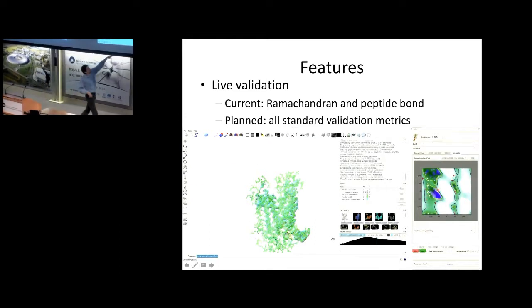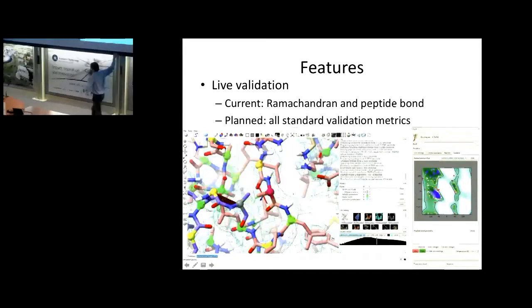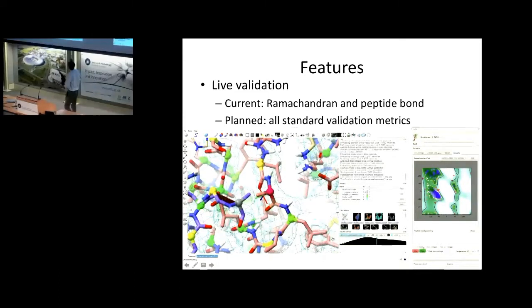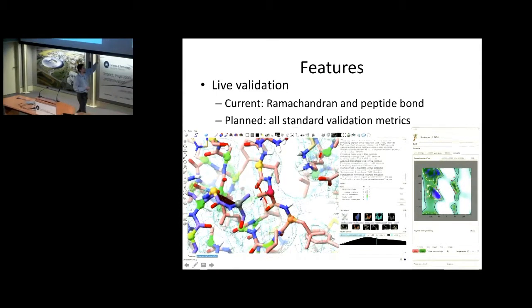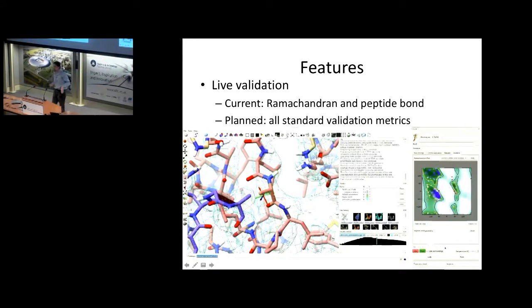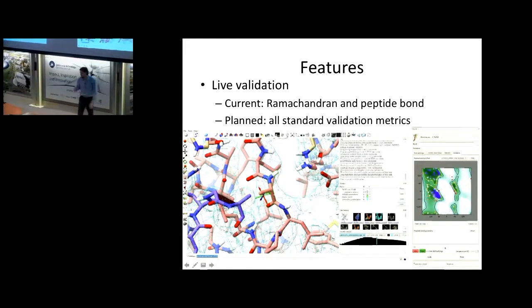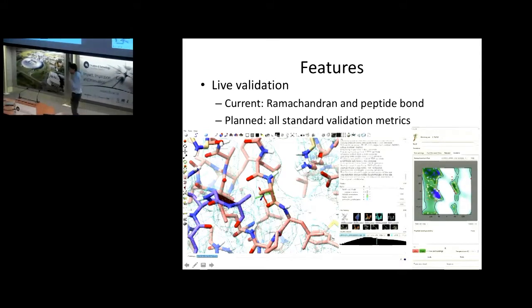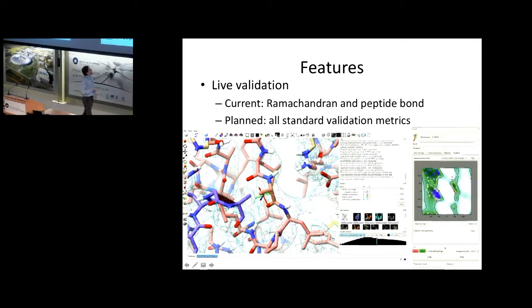And so I've got the Ramachandran plot here. I mean, you see it updating here. The update is actually a lot faster than what you see. I'm only doing it once every 10 frames, but for a simulation this size, a few hundred residues, it takes 2 milliseconds to recalculate the outliers. And then you click on any outlier there, it'll take you to that. And you can start a little local simulation to actually try and figure out what exactly is going on in that position.